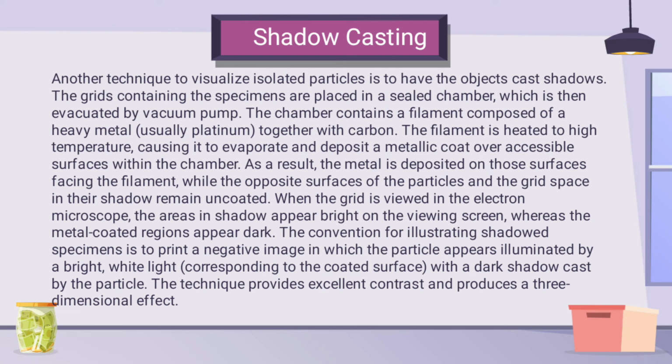The convention for illustrating shadowed specimens is to print a negative image in which the particle appears illuminated by a bright, white light with a dark shadow cast by the particle. The technique provides excellent contrast and produces a three-dimensional effect.